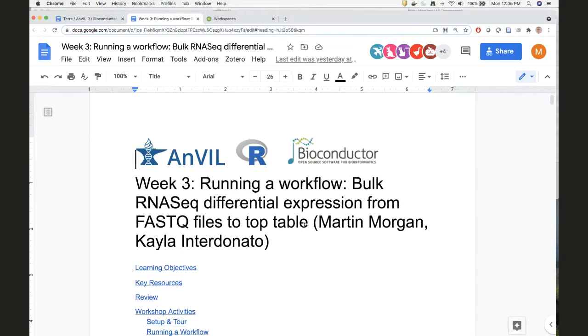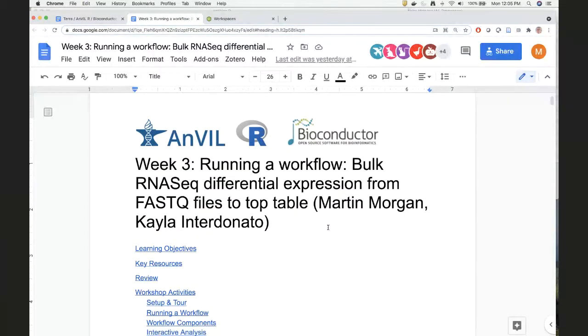And also, it's quite difficult if you're just running on your laptop. One part of it, the FASTQ files to count matrix, is relatively complicated or requires a different set of skills from the interactive analysis. So it seems convenient to think about how that might work in the cloud. So it seemed like a good topic.